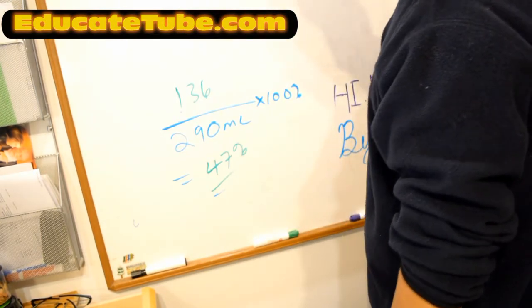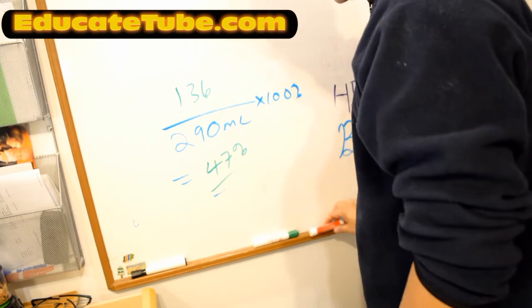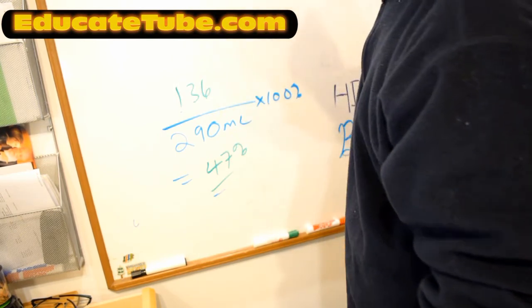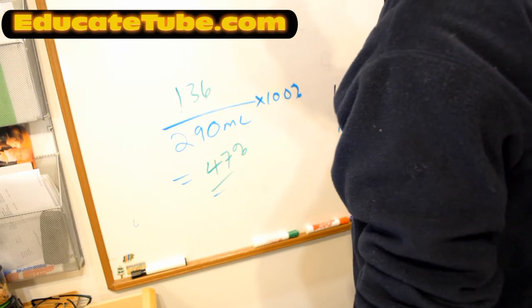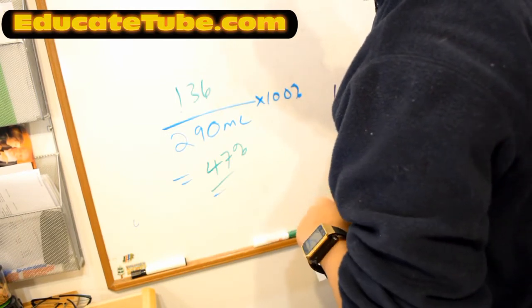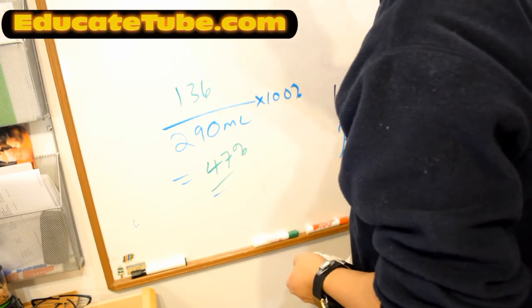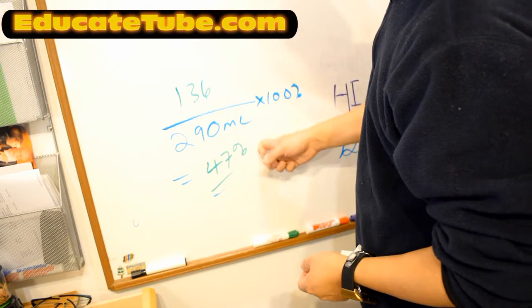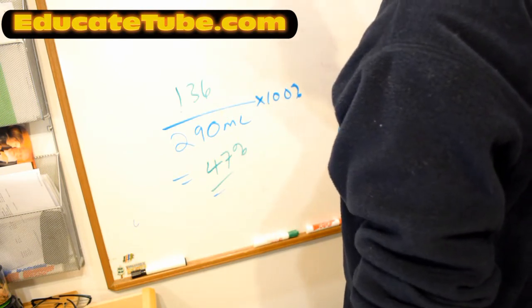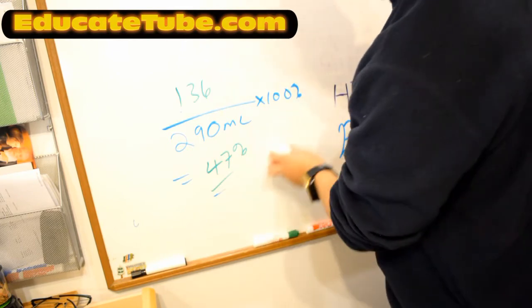So accounting for some of these errors that I went through, like some of the gas escape, the cork was releasing some gas because what happened is the rubber tubing was squeezed, and so the air moved out of the test tube instead. So let's see if I improve on this 47%. I'm hoping I can get around 90%, but we'll see.